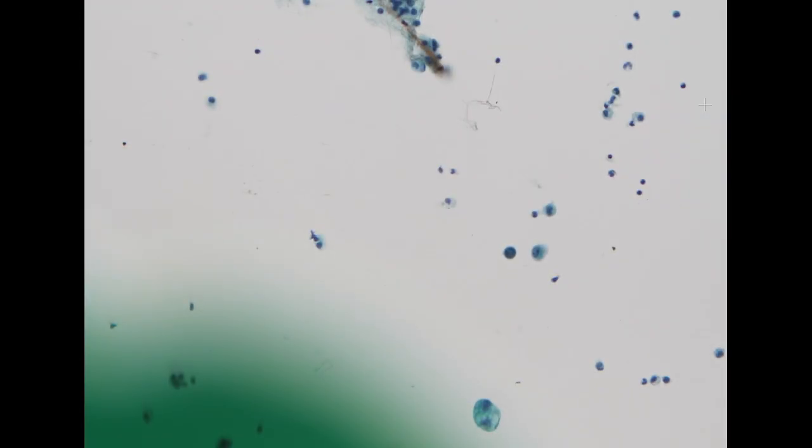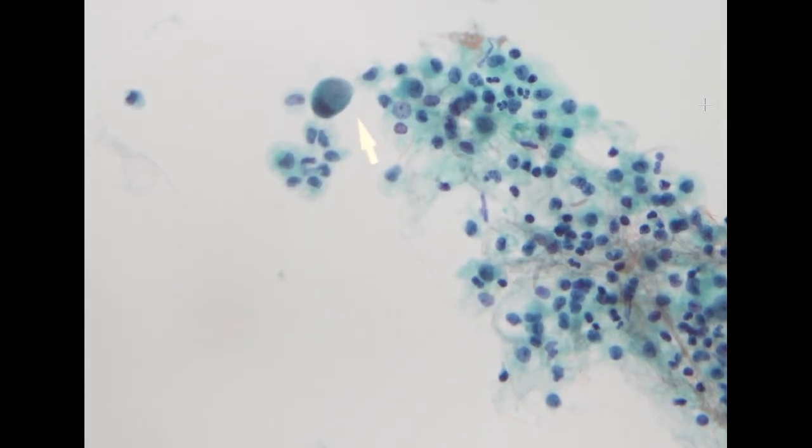The next specimen is from an ascites. The patient had a past history of pancreatic cancer. So now we are very familiar with this morphology. These are most likely histiocytes and some lymphocytes. But this one with an eccentric nucleus and some mucin in the cytoplasm, this one is metastatic adenocarcinoma.